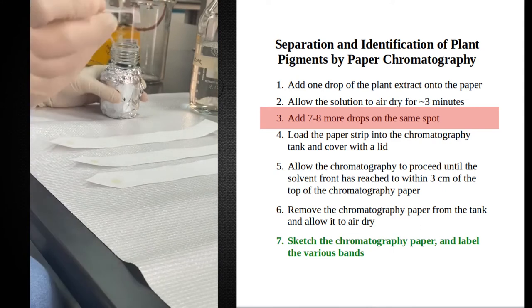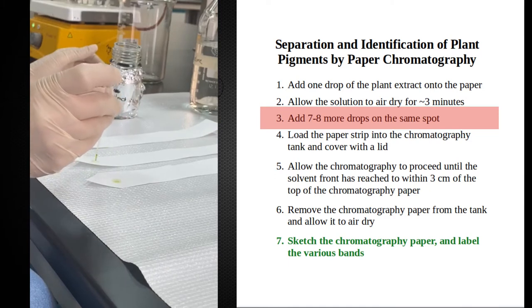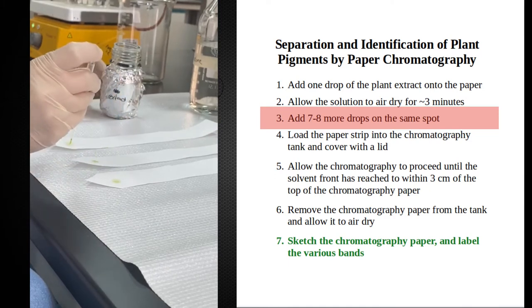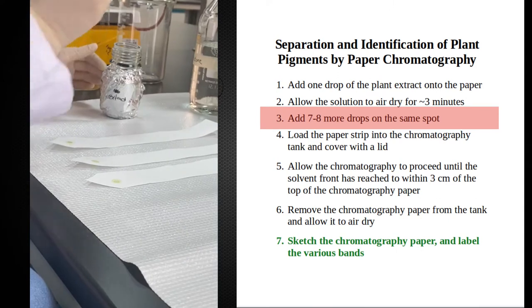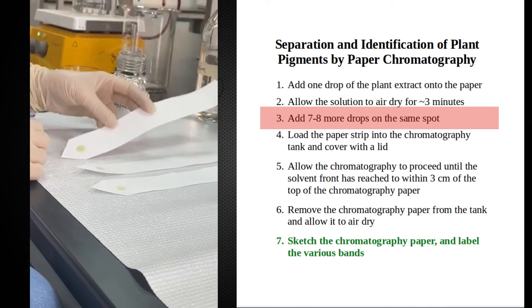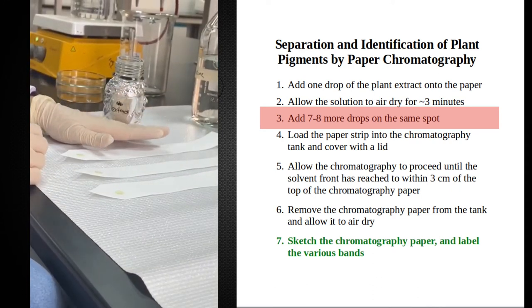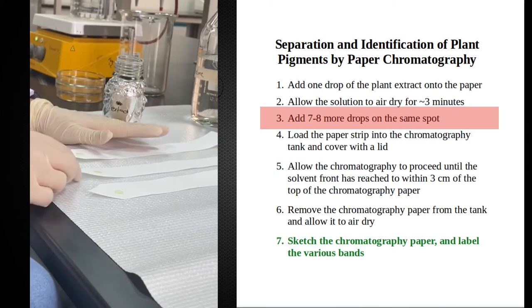We are waiting for the spots to dry and then we are adding more of the chlorophyll extract. This is spot number four. I'm waiting for three minutes between one spot and another until it dries. We will add up to seven spots and then transfer the papers to the chromatography chamber.